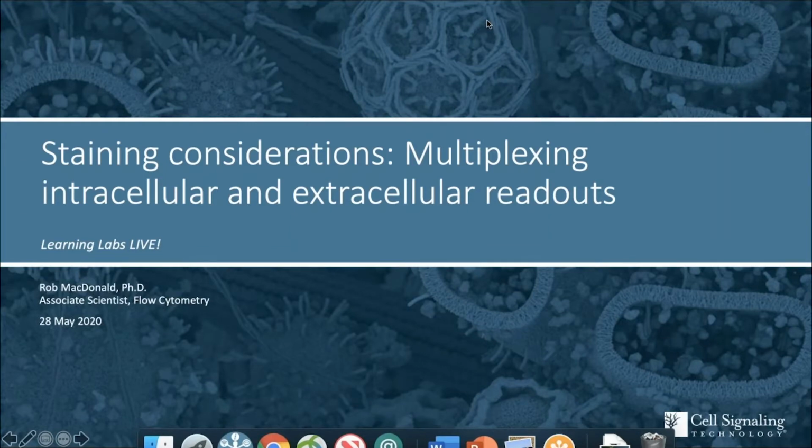Today I'll be presenting the flow cytometry focused panel of Learning Labs Live. Today we'll be talking about some staining considerations when multiplexing with intracellular and extracellular readouts.